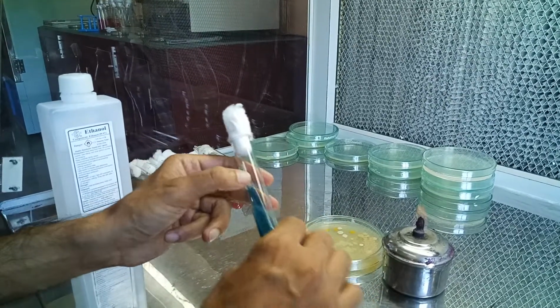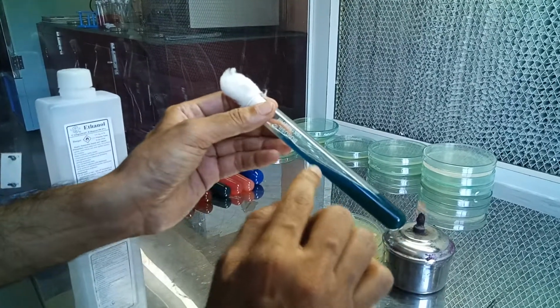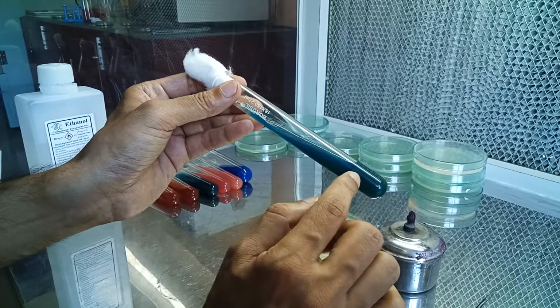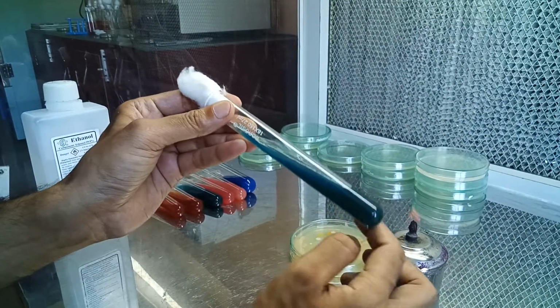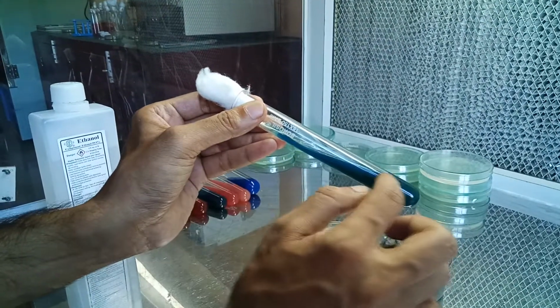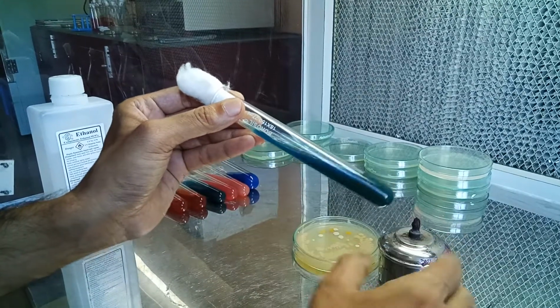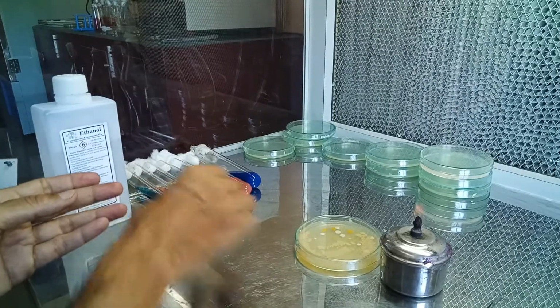Now let us perform the test. And one more thing that is essential for us to know is we prepare a slant here. Now when we prepare a slant, we must take care of the fact that there has to be a butt portion. If you see, it is completely filled in the tube, and there is a slant portion wherein we have a slanted solidified medium. So we need a slant for carrying out Simmons citrate utilization test.